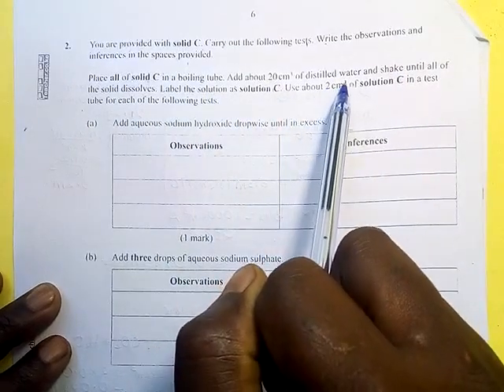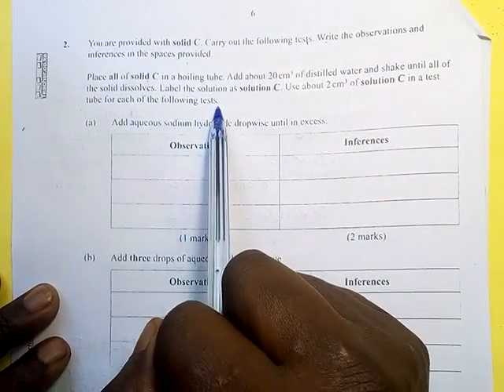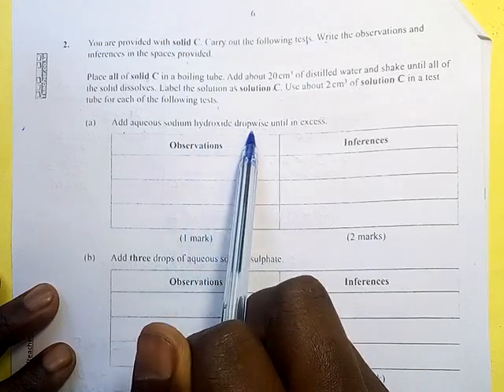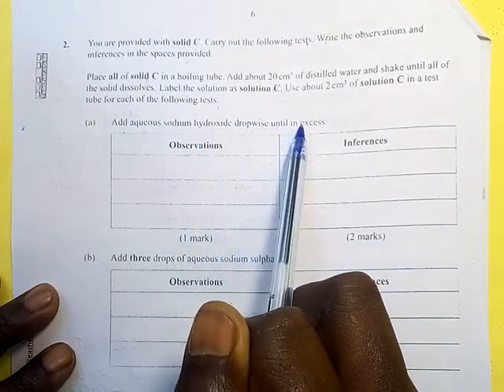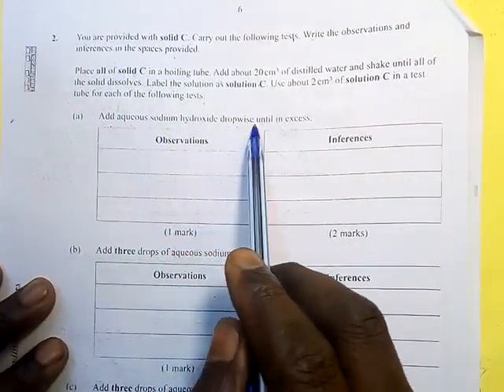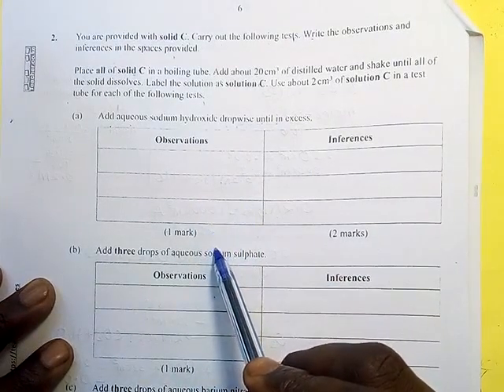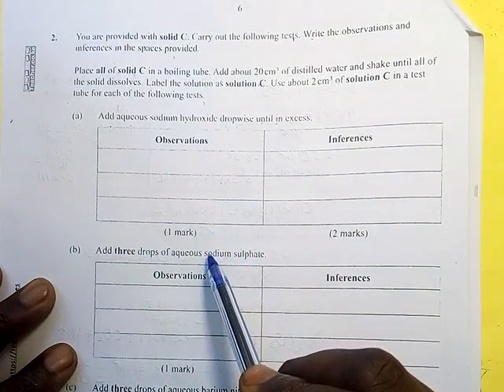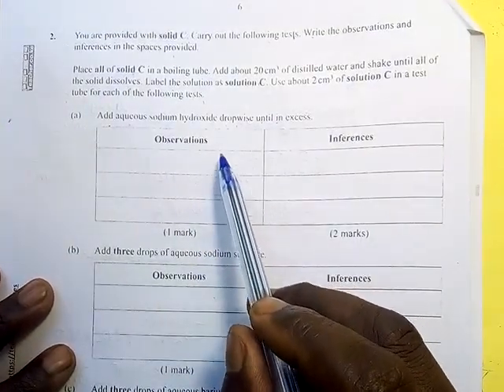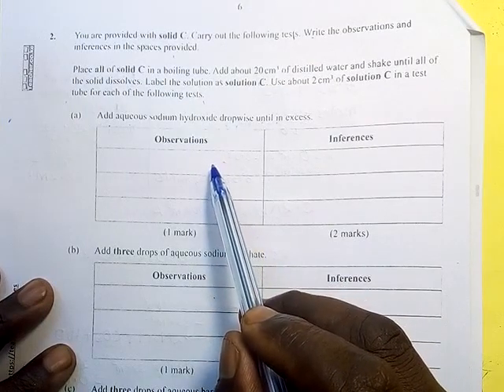Use about 2 centimeters cube of solution C in a test tube for each of the following tests. A. Add aqueous sodium hydroxide dropwise until in excess. This is now where the students go wrong. When you are told to add dropwise until in excess, first use 2 drops, make the observation, see what will happen, and then afterwards, add the sodium hydroxide in excess and make another observation, because here you are expected to make 2 observations at once, simultaneously.